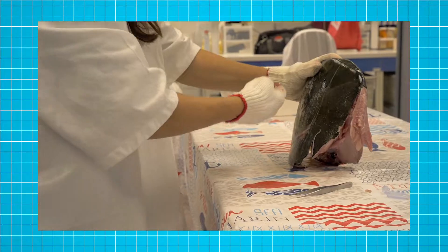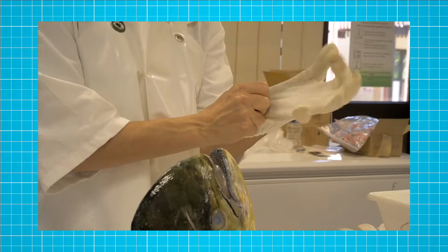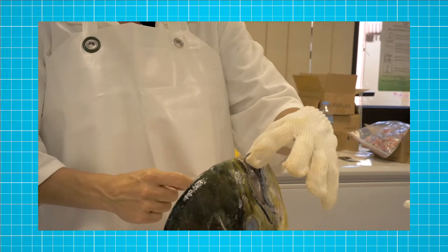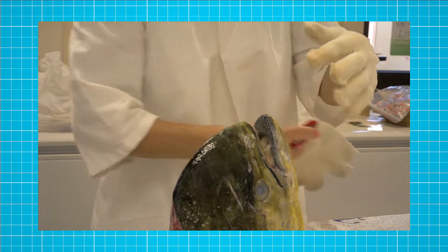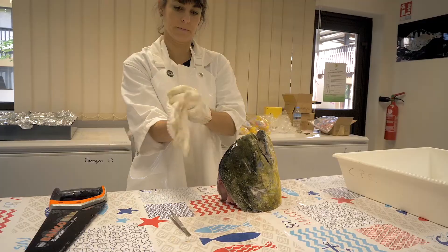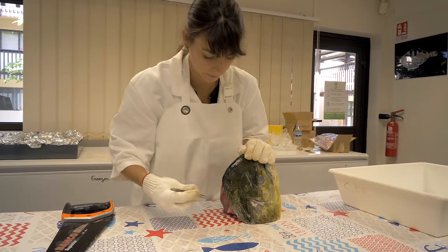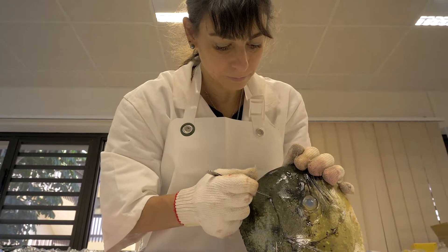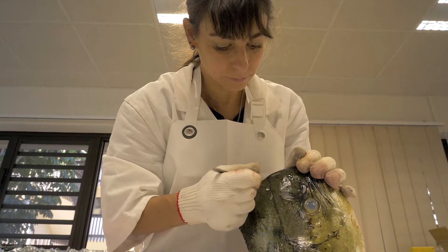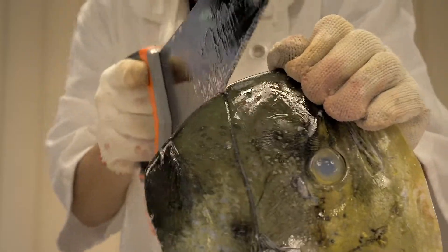The easiest way to extract the otoliths is after the head has been removed from the rest of the body. The technique I'm going to show you is cutting the top of the head of the fish to access the brain cavity. First, you need to stabilize the head on the table. What I do is I use my tweezers to trace a line on where I'm going to use the saw to cut the top of the head. I will try my best to follow that line.